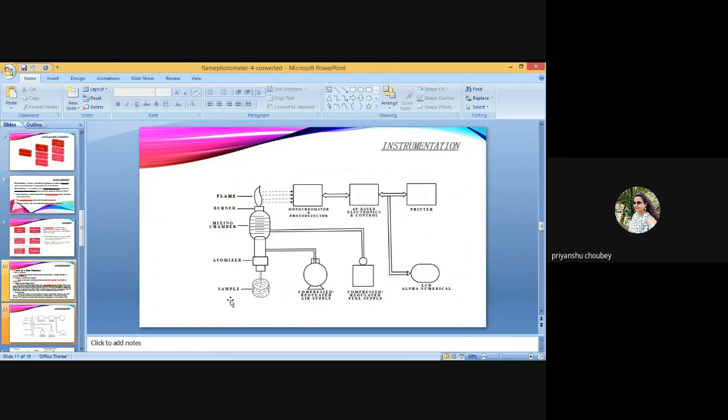Visual comparators: the simplest color comparators use side by side viewing of light coming from a common source through a pair of matching flat bottom tubes, one containing the test solution and the other the standard. On matching the two, the ratio of the vertical height of the solutions would be inversely related to the ratio of their intensity.